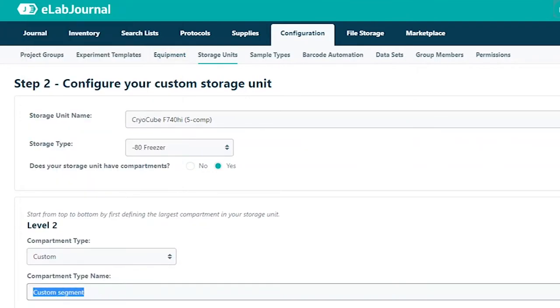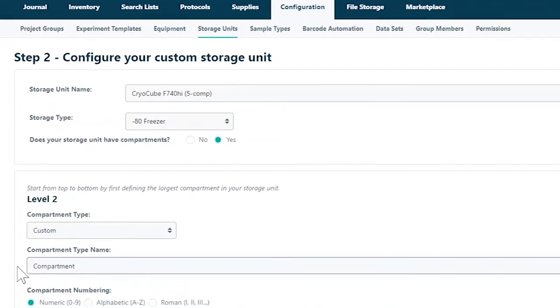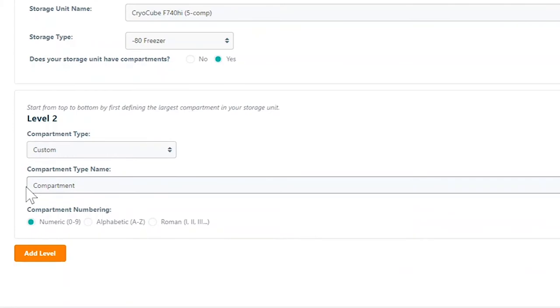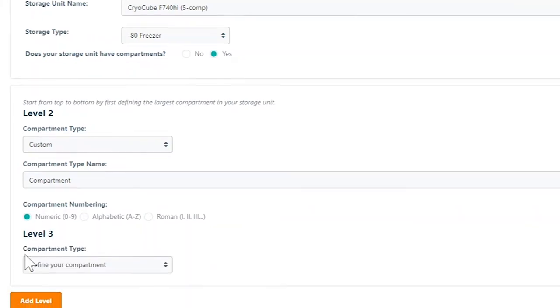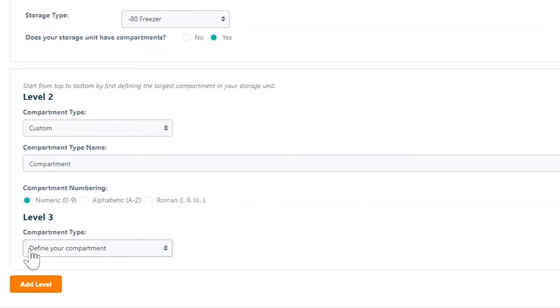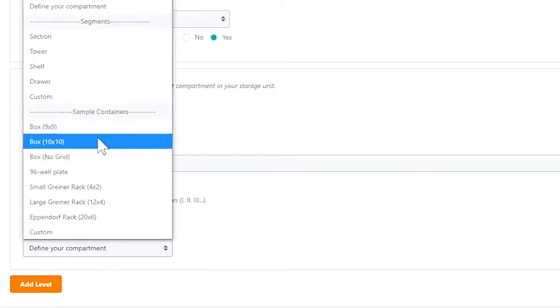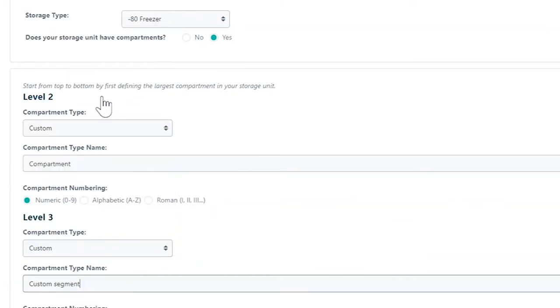Add simple segments or sample containers or create custom compartments. You may add as many compartment levels as necessary to ensure a complete graphical representation of your lab.